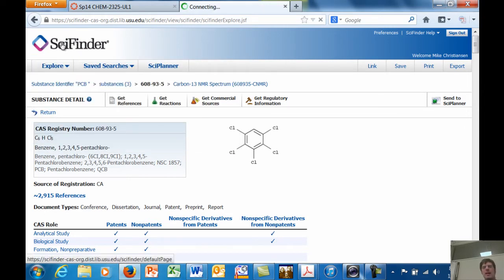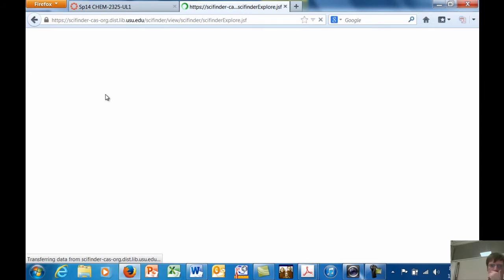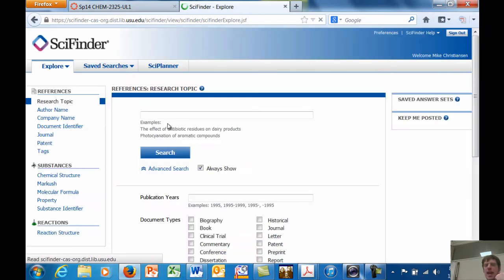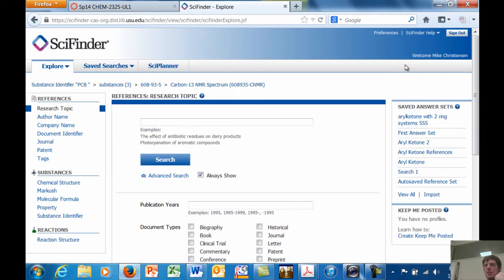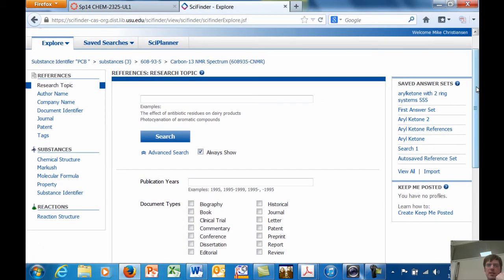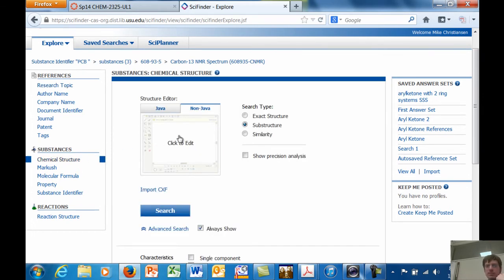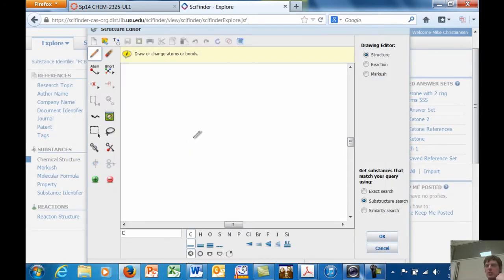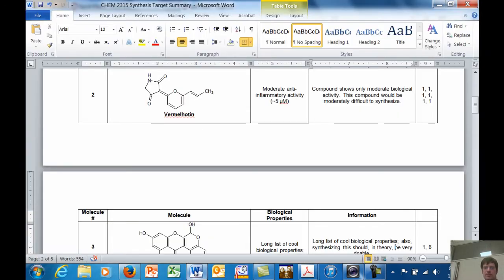Let's go back, though. You might not have a compound that has a particular name. You might just want to draw a structure. You click on Chemical Structure. Click on this, and it opens a structure drawing window. And you can draw any molecule you want.